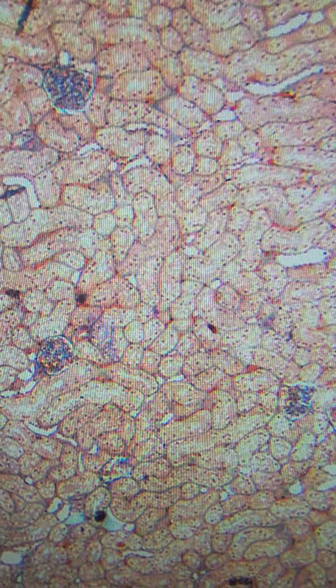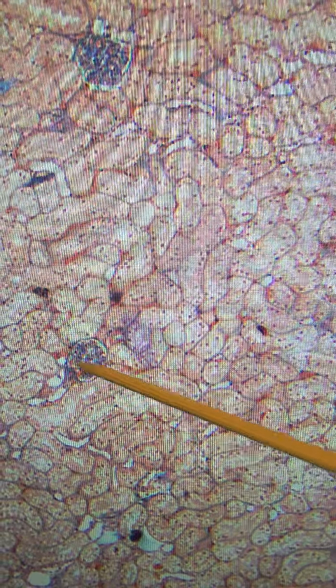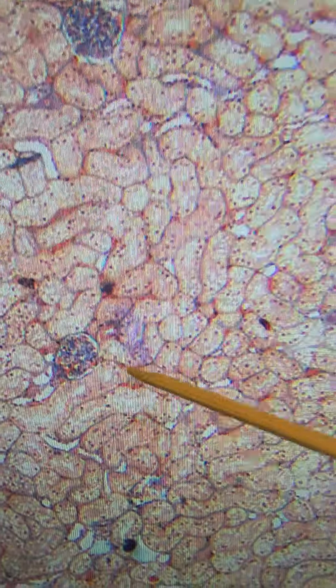This is a slide of kidney tissue, and we can see the glomeruli. Each glomerulus is surrounded by Bowman's capsule. I'm going to increase magnification.